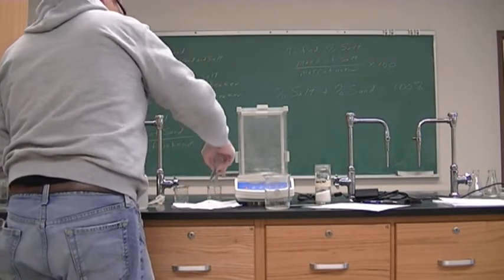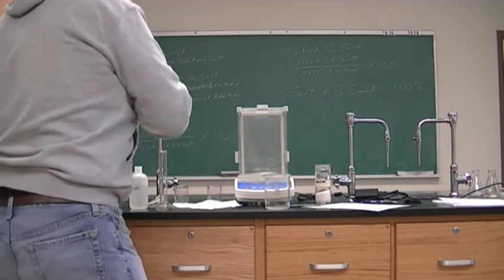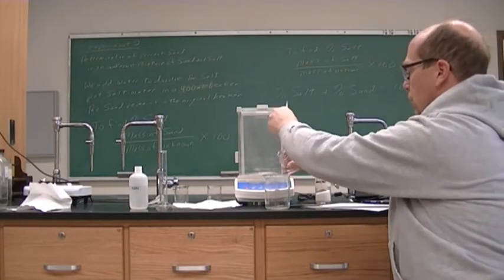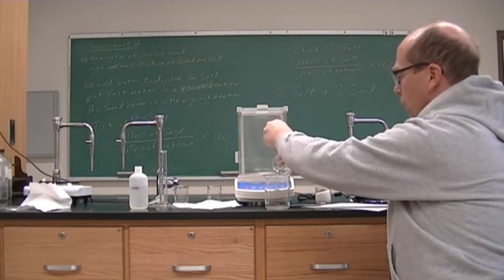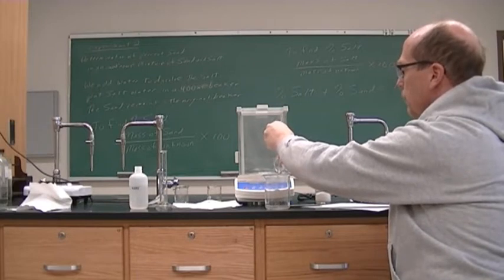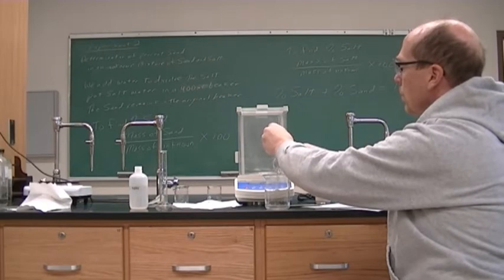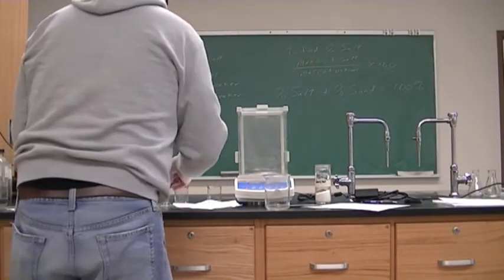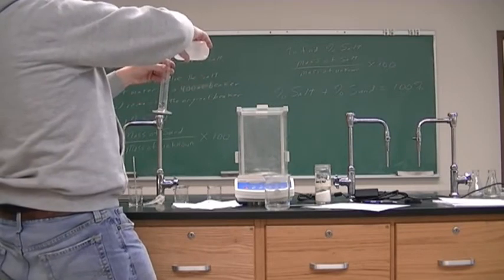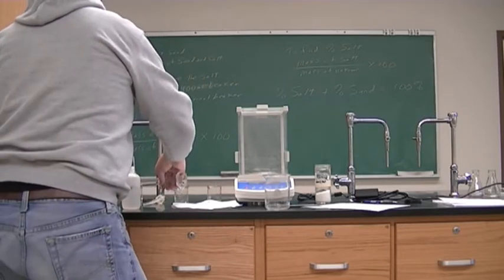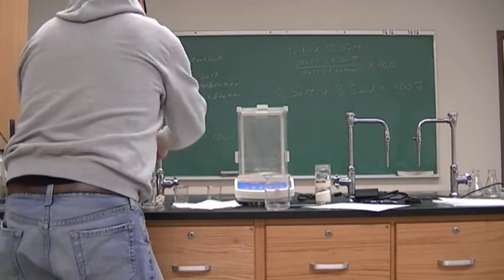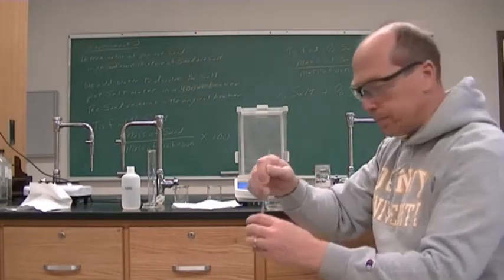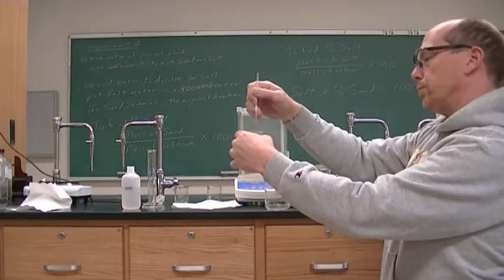The amount of water is approximate, so about 15 ml of water. Back to beaker number one — we're going to decant again. All that means is the salt water is being removed and the solid sand is staying in the small beaker. One more time for beaker number one — put in another 15 ml of deionized water. We are making sure that all of the salt has dissolved in water. All the sand remains in the small beaker.